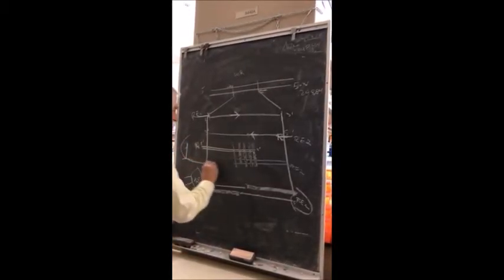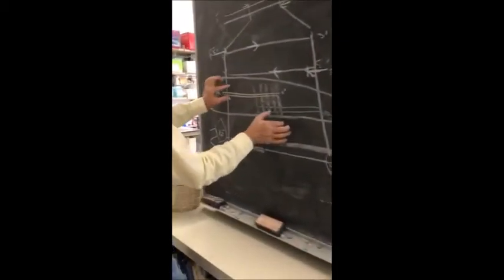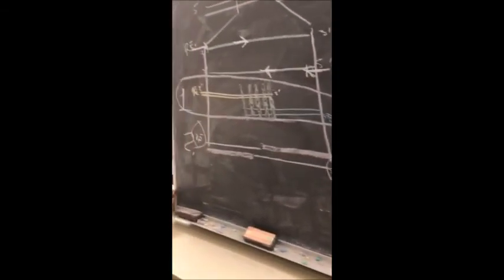So this is the first PCR that you guys did, and your data is in your book, right here. And so you can see that your 5' end and the 3' end are amplified, done in duplicate. So now the next step is you want to clean these fragments, quantitate them, mix them together in a molar ratio, and then let it amplify out. And there you go. Bye-bye.